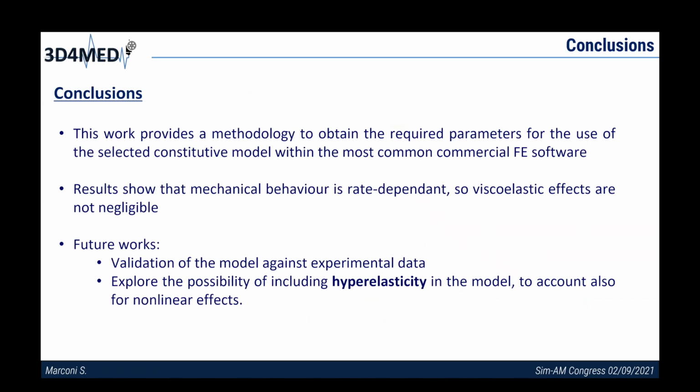Okay, so drawing the conclusion of this talk, with the methodology that we presented, we were able to implement a code that allows to move from the mechanical characterization thanks to a rheometer to the definition of the required parameters to use a viscoelastic model into commercial finite element software. Results show, as expected, that we have a behavior that is rate dependent, so viscoelastic effects are not negligible as commonly done in the literature about those kind of materials.